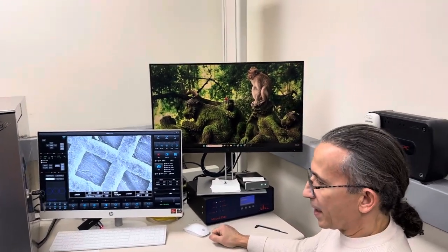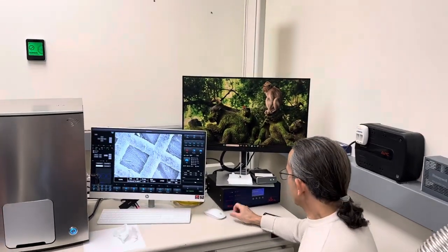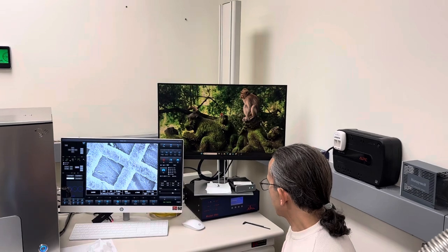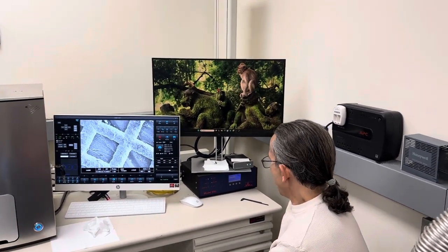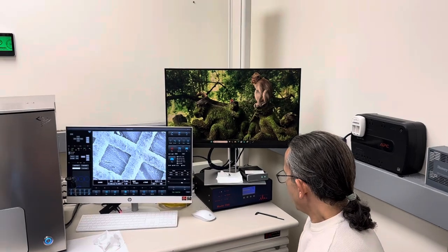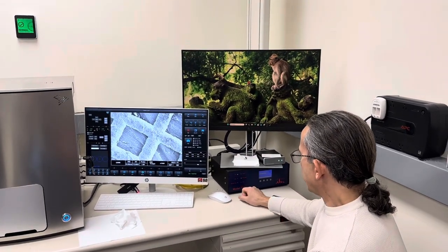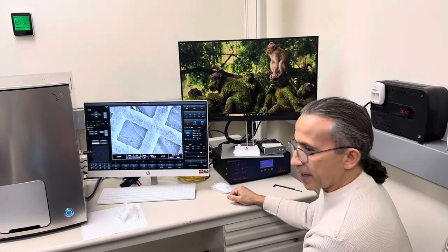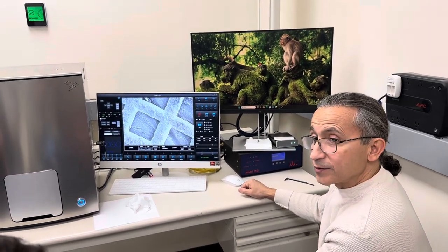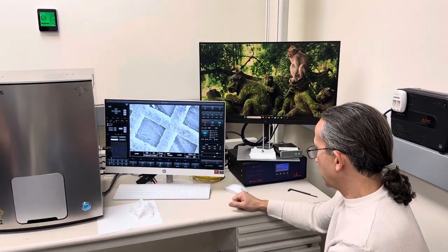This right here is our IXRF analyzer, so this is our EDS analyzer. And you notice that there's some lights moving around on this thing right now. There's some blinking happening, and every LED on here has a feature. So right now we have I/O, input output, it's yellow. It's telling us that we're talking to the PC. So we're communicating via an Ethernet cable to the PC, so that's good.